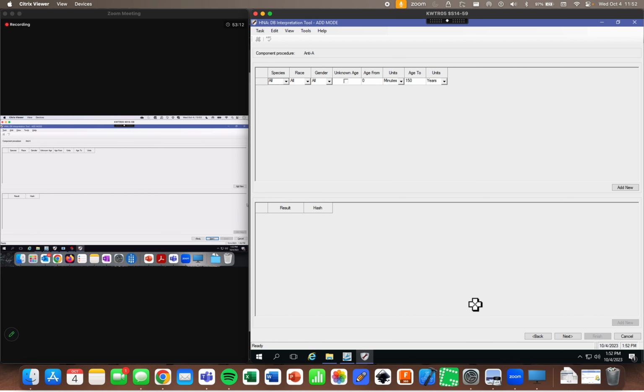This is usually how folks get mixed up, because they look exactly the same, but one adds to the top and one adds to the bottom. Most of the time we need 1 row at the top and then multiple rows at the bottom. If you get it mixed up, you end up with a whole bunch of extraneous rows that you don't need. So I'm going to single click just once the add new button at the top.